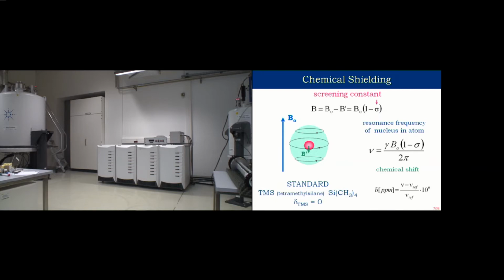So finally, because of these orbits, which sometimes possess very crazy shapes, these currents generate different additional values of local fields, changing the frequencies and the line width for each independent nucleus. And we use this in high resolution spectra very often.